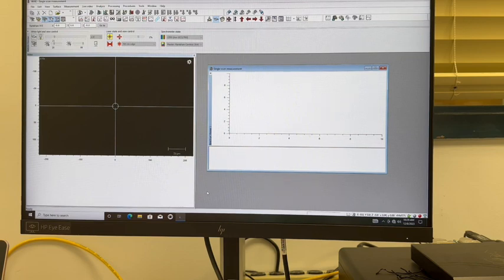However, if you have a sensitive sample, you may want to do 2 or 3 accumulations. This will take 2 or 3 measurements and then average them together. If you are working with a sensitive sample that will burn easily, you want to start with a lower laser power and a lower exposure time. This will prevent the sample from burning. To lower the exposure time below 10 seconds, you must perform a static scan, and therefore pick the spectrum range.